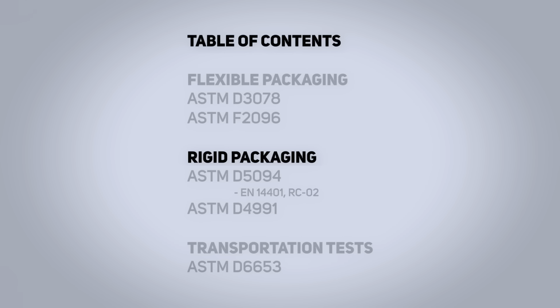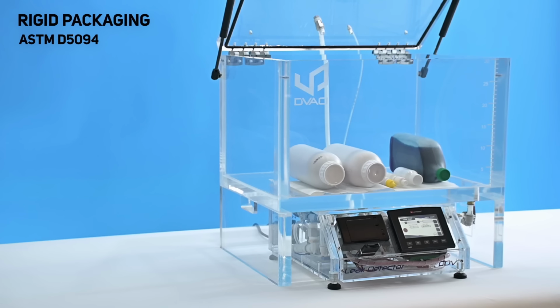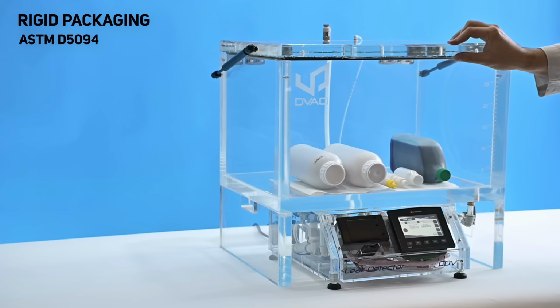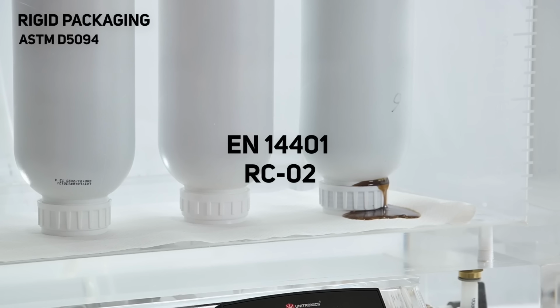The ASTM D5094 standard focuses on leak detection of liquid-filled rigid containers, performing a dry vacuum test to observe leaks if they occur. Although this standard was withdrawn without replacement, alternatives such as the European standard EN 14401 or our own protocol RC02 exist.